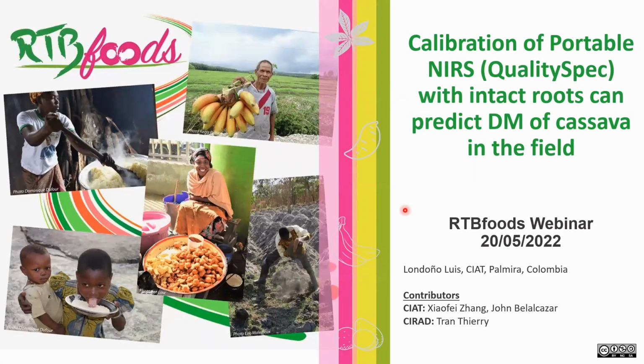Today the presentation is called Calibration of Portable NIRS with Intact Roots Can Predict Dry Matter of Cassava in the Field. The idea of this test is to use the portable NIRS QualitySpec for the breeders, because sometimes it's difficult in the field to get the dry matter of the samples. With the portable equipment, we can go to the field, and with the spectra that we obtain in the field, we can do the prediction.